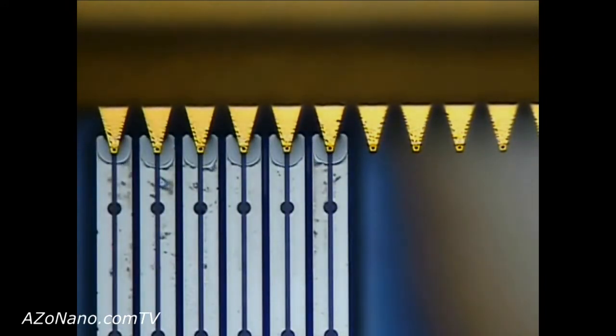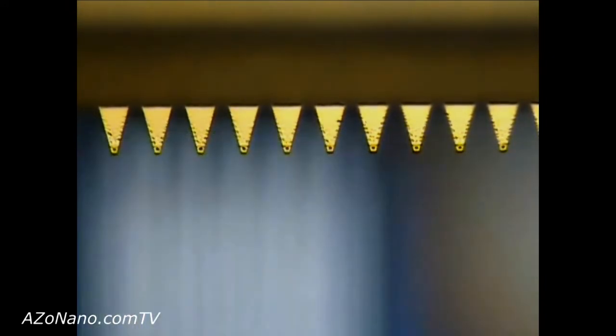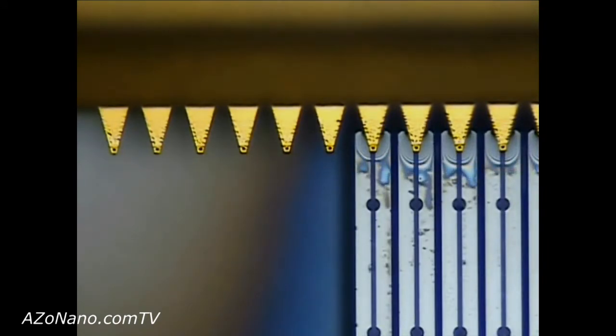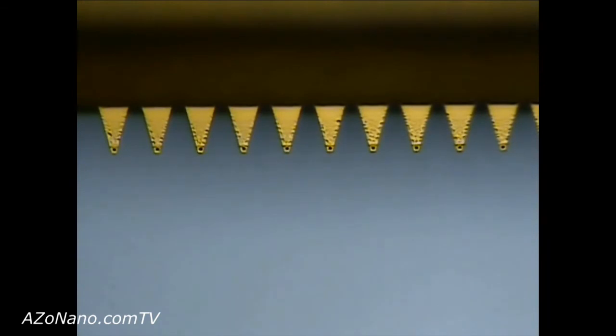so it is a much simpler system to use, works over much larger ranges, and we are actually covering a 40mm by 40mm surface with nanostructures at this point.